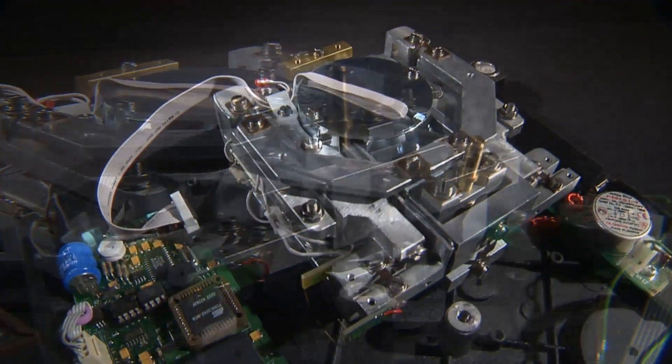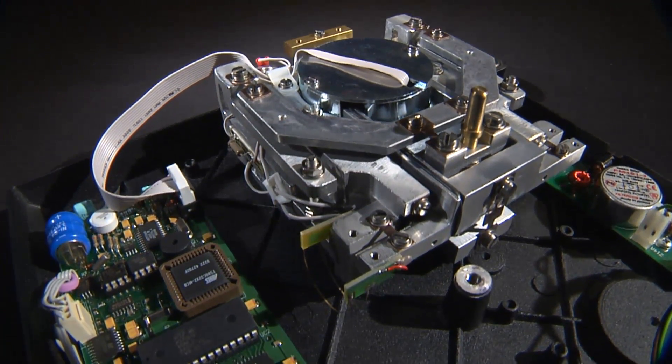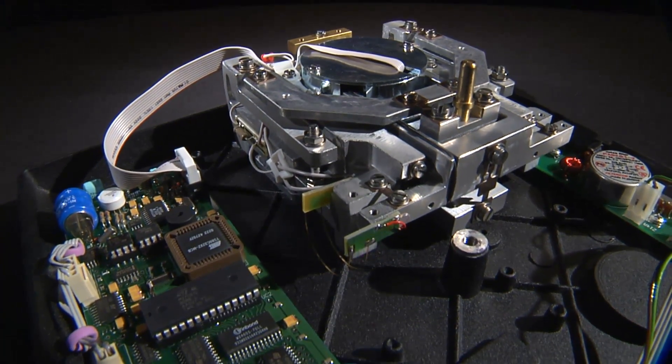The mechanism is carefully assembled, adjusted and calibrated by highly qualified and trained technicians.